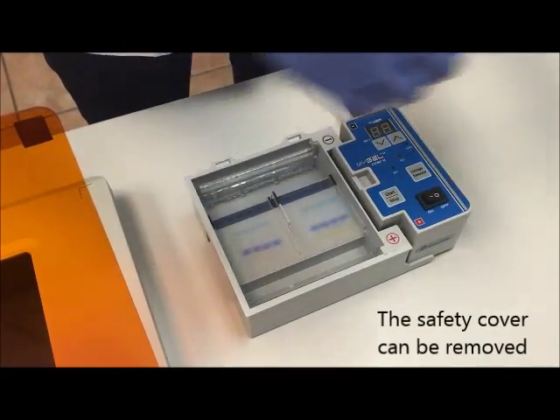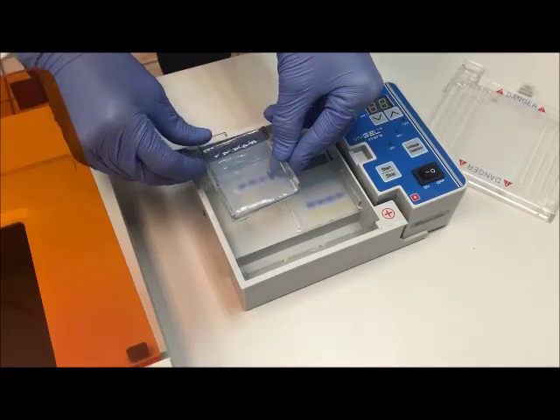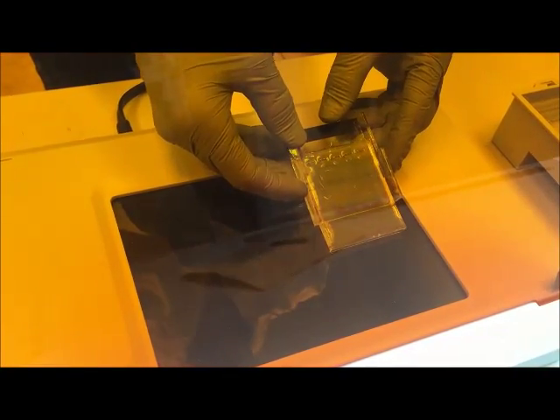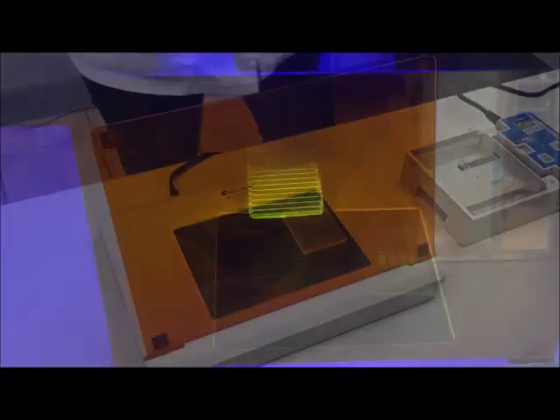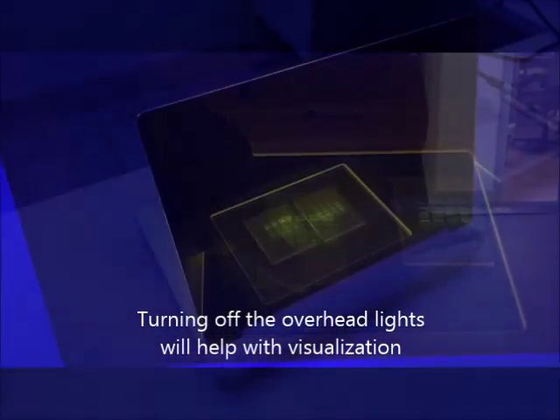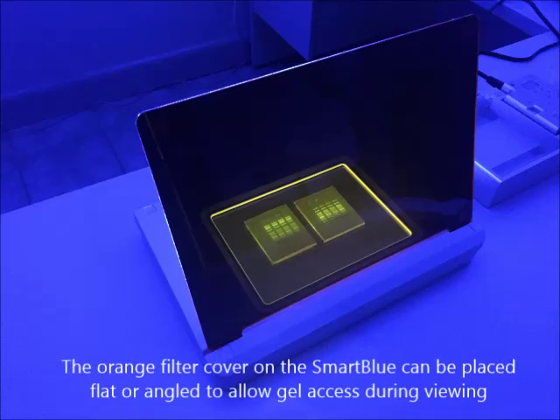You can now remove the lid and remove your gels. The gels can be removed from the gel trays by gently pushing on one end. We're using the Acuras SmartBlue Transilluminator, which emits blue light at 465 nanometers — ideal for excitation of most safe green stains such as the SmartGlow stain added to our samples. The blue light excites the SmartGlow stain attached to the DNA molecules. The orange filter cover on the illuminator blocks the blue light and allows us to clearly view the fluorescing DNA bands. The orange cover can be placed flat on top of the viewing surface or angled to allow access to the gels.